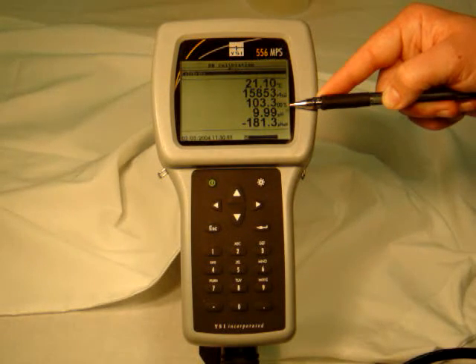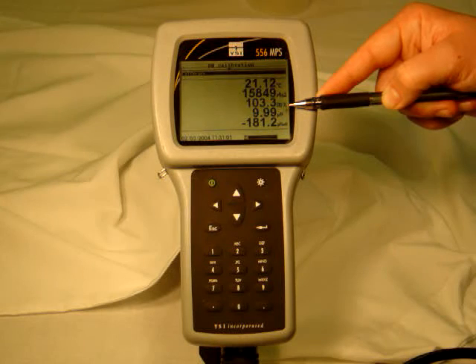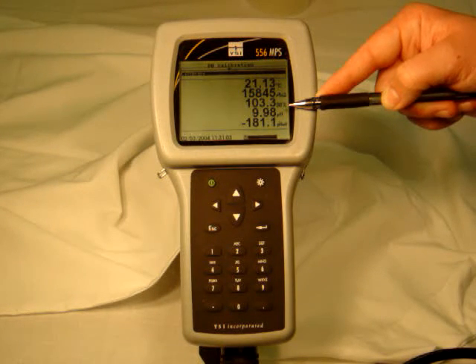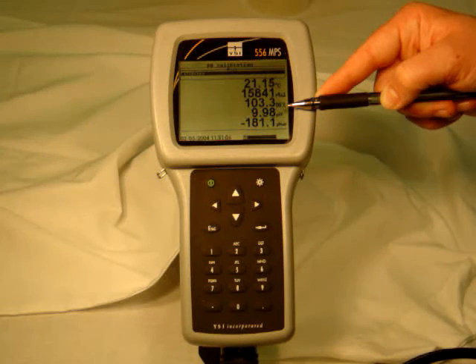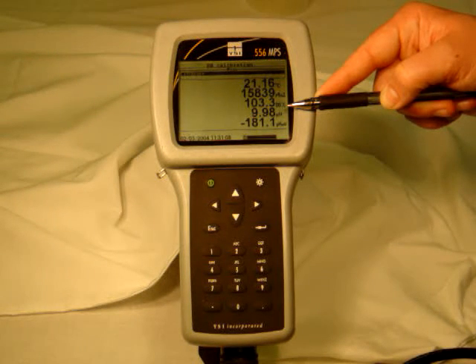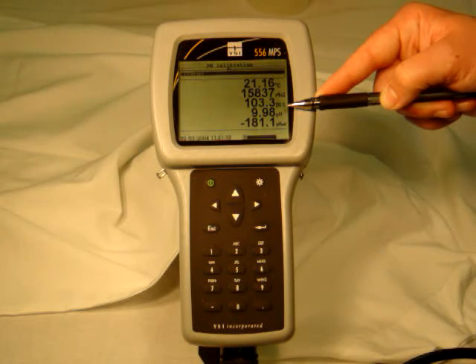It's a big fog. Stabilizing now. See, it's actually not changing the pH — the temperature's changing, so it's the compensation that's changing it. As the temperature goes up, the pH is dropping, isn't it?